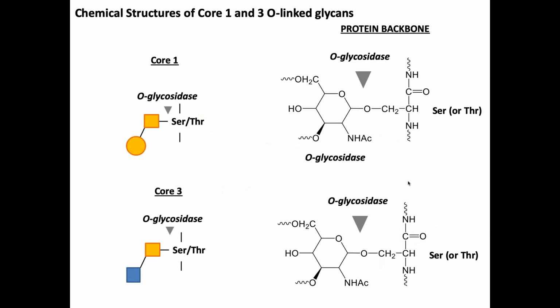I think this slide set is obviously going to change a good bit as you move into these new technologies, these new instruments that don't require you to do these types of things. But these methods will still have their own place. You never want to just say, oh, we don't need to use this anymore. There will always be reasons to use something, whether to validate or reinforce what you're seeing in the mass spec, or other reasons. And no matter what you think the mass spec can do with some purified protein from Sigma, and you say, oh wow, all our problems are solved, it's never in my life been that easy. I've always run into different issues.